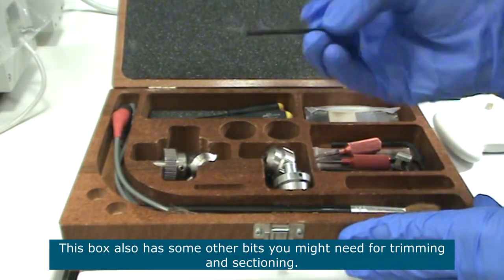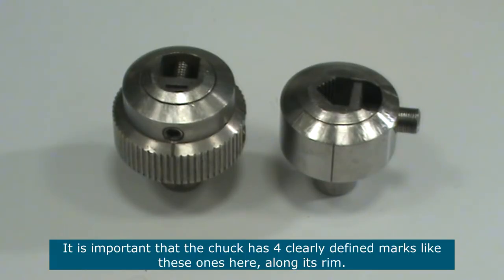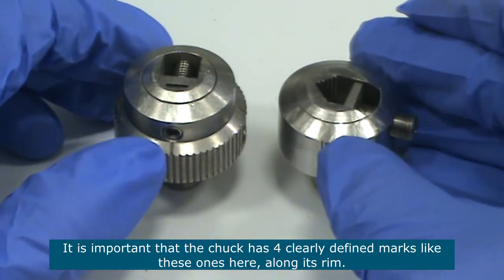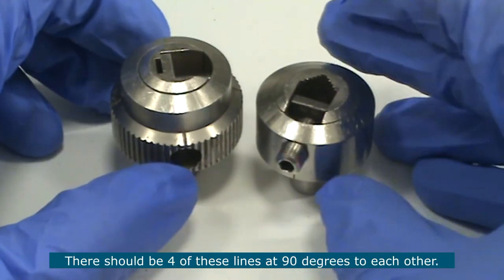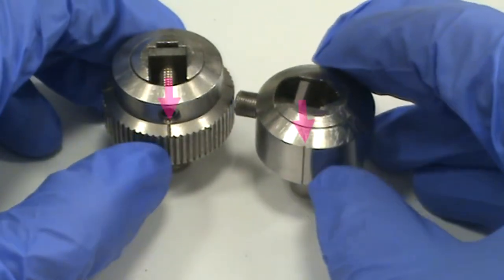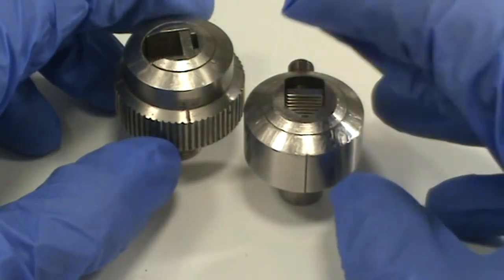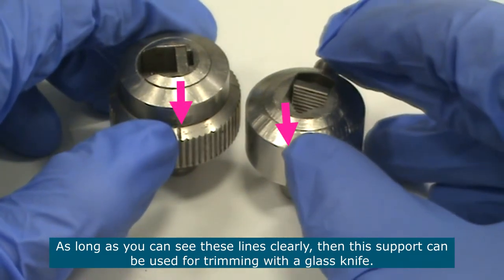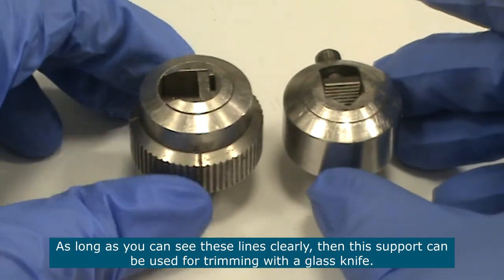The chucks or sample supports used for trimming and sectioning should all be in this box here. When you're trimming with a glass knife it's very important that the support that you use has four clearly defined marks like these ones here — these lines. There should be four of these lines at 90 degrees to each other. As long as you can see these lines clearly going all the way across, then that support can be used well for trimming with a glass knife.